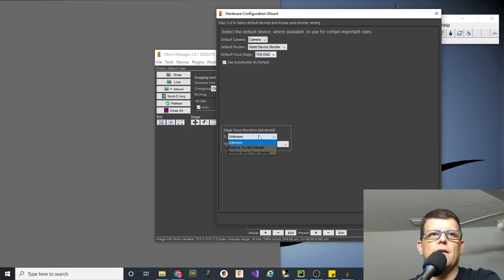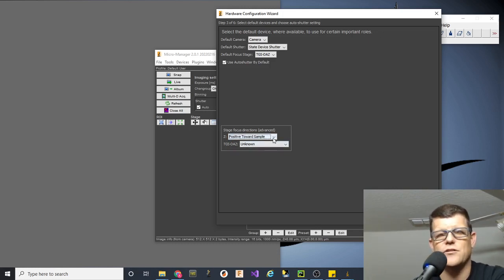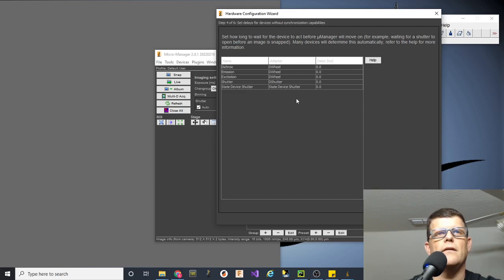We'll do that. Okay, here we'll probably choose positive is towards sample, because normally when positive value increases, your stage is going to raise, whether it's off of a nose piece or whether it's off of a stage mount. And then actually this guy can be unknown because that's the MicroManager Z, but our guy here is going to be positive towards sample. All right. Now we'll have the, let's see, state device shutter. We can add a delay if we want.